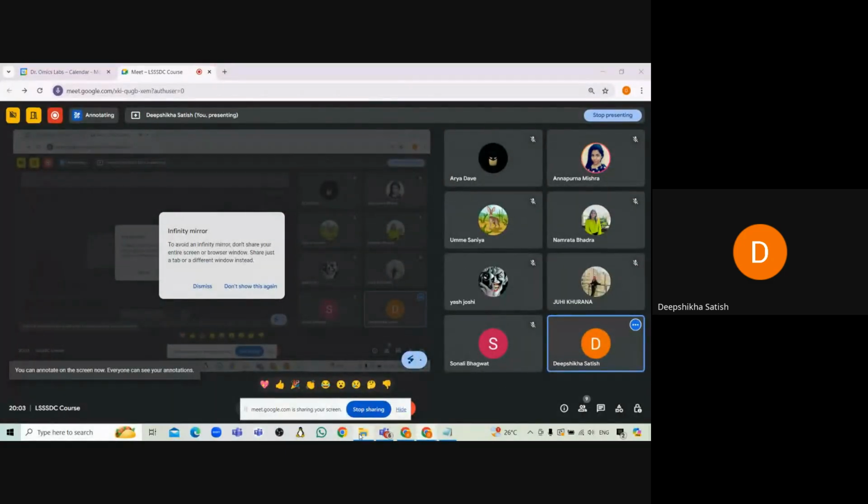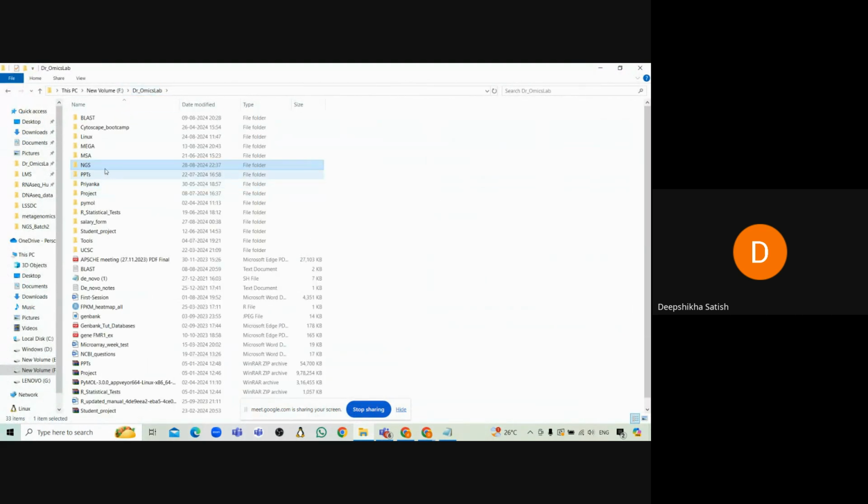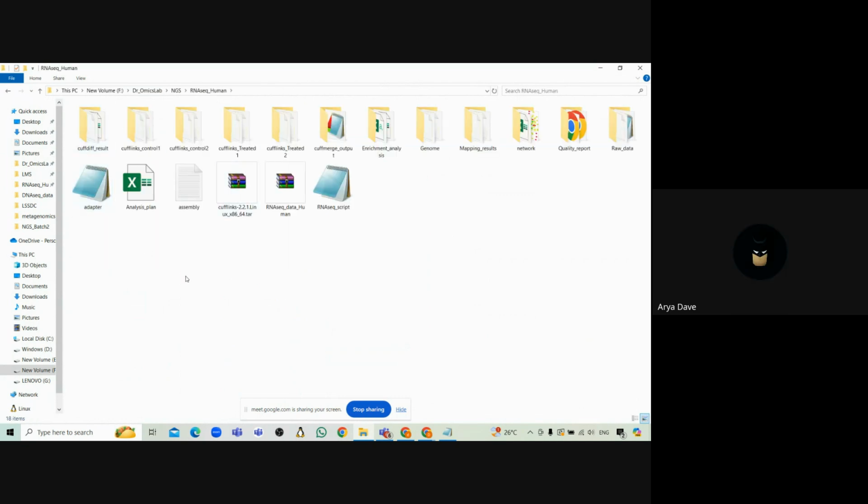Okay, fine. Let's go with our next step, that is cuff merge. So I will show you how to prepare the command. Is my screen visible? Yes, ma'am, it is.